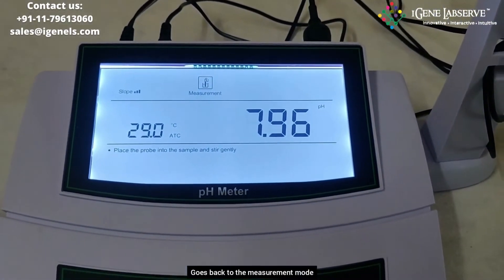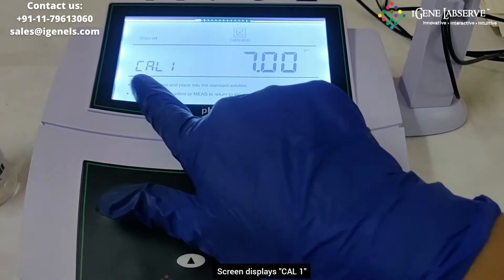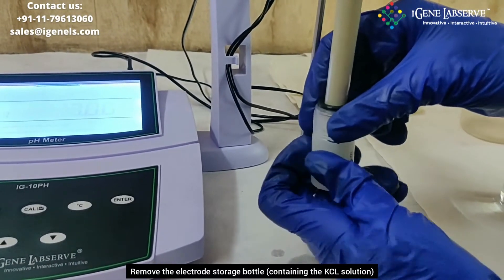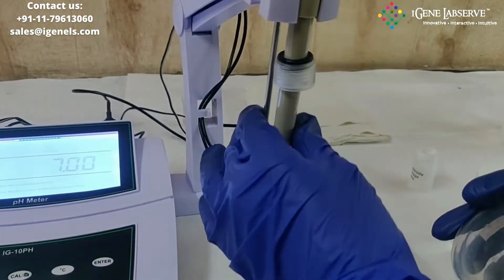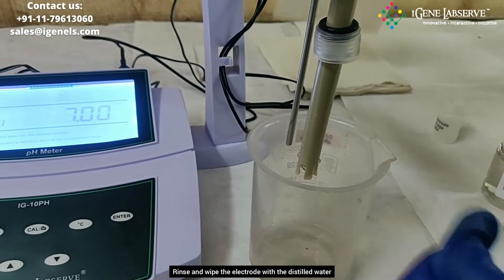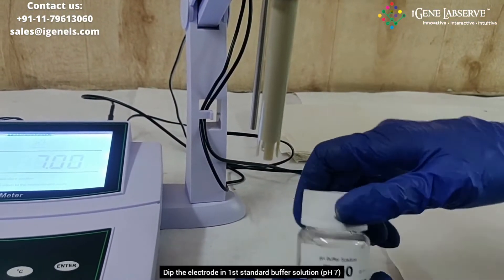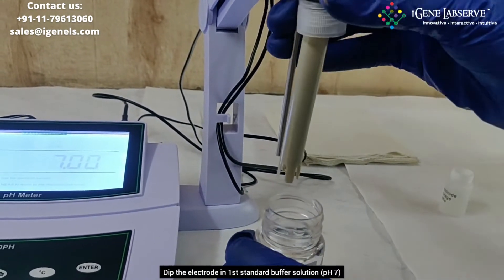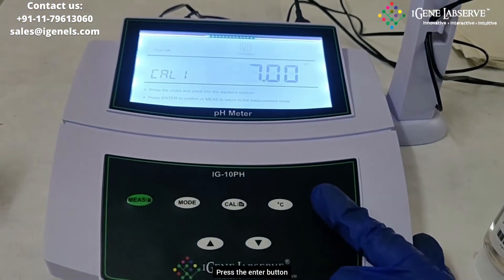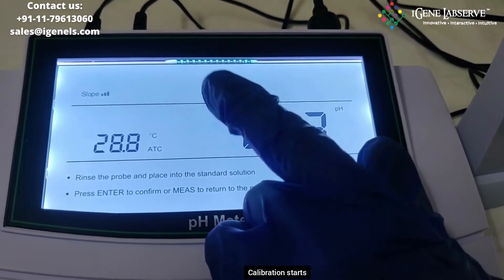Press enter to return to the main screen, then enter calibration mode by pressing the cal button once. The display shows calibration one, which is pH 7. Remove the electrode from the storage bottle containing KCl solution, then take a beaker and wash the electrode and wipe it. Now take the pH 7 buffer solution, place the electrode in it, and press the enter button. It begins to calibrate, and the blinking display indicates that calibration is in progress.